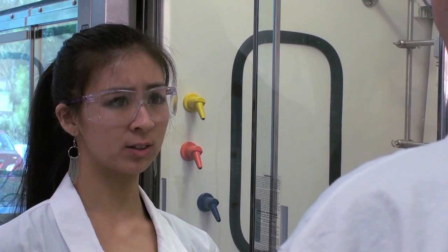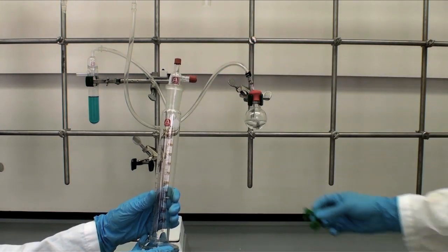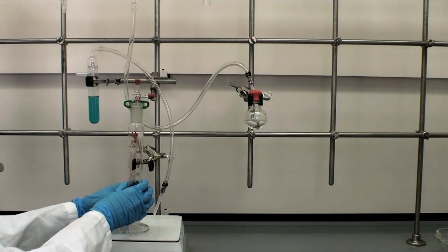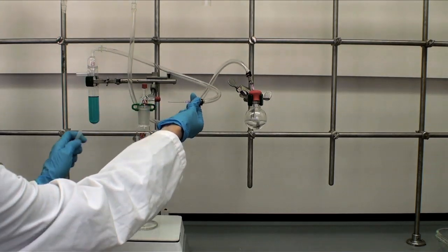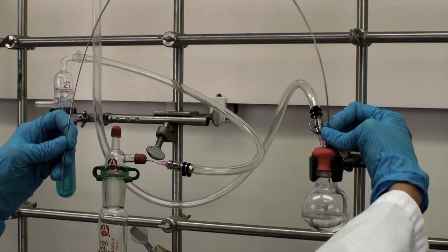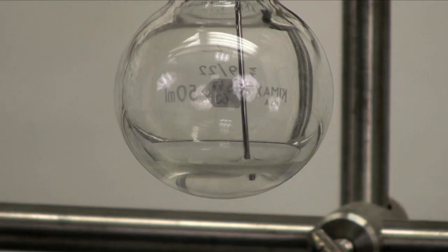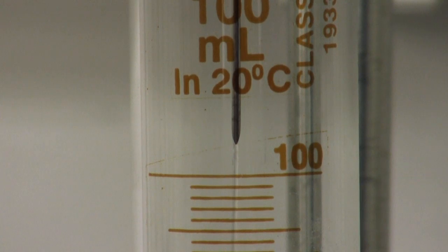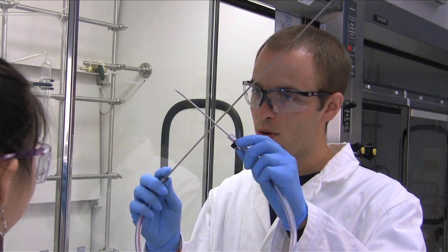What if you need to measure large volumes accurately? We use a graduated cylinder with a special adapter that is clamped on top. Do we just use the same procedure as we used with the flask? Yep, that's correct. Why don't you give it a try? That worked well, but it'd take a long time for large amounts of liquid. Well, for larger amounts of liquid, we have larger equipment. Alright, I think we're ready to run the reaction with the real thing tomorrow.